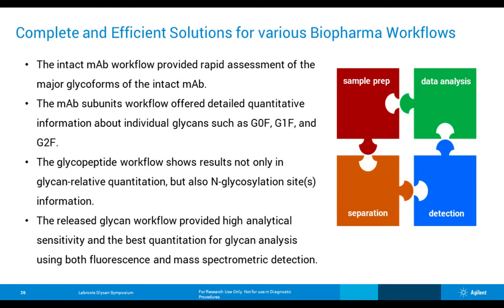Okay, great. Next, can I perform the intact mass, subunit, glycopeptide and released glycan workflows without the AssayMAP Bravo system? Yes, of course. But the manual sample prep would take much longer and the reproducibility is kind of low.